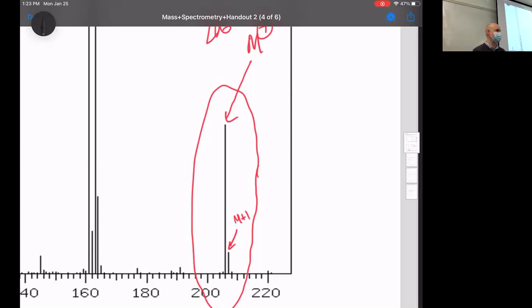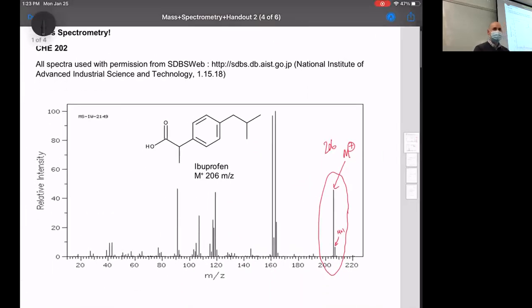For carbon and hydrogen, the isotopes are pretty predictable. You'll get a little bit of +1. You shouldn't worry too much about that. It's going to be there. It doesn't impact anything, but that's going to end up being something important for later on today. So you'll see an M+1 peak. Don't worry about it. It means you have carbon or hydrogen, which isn't very helpful for us because obviously you have carbon or hydrogen. All right, so that's ibuprofen.